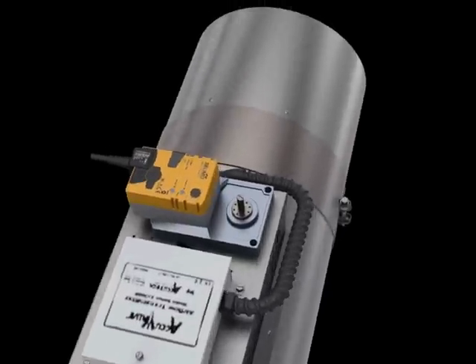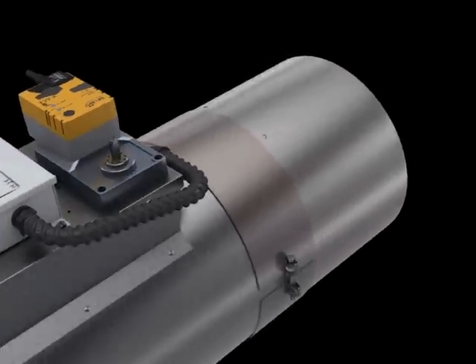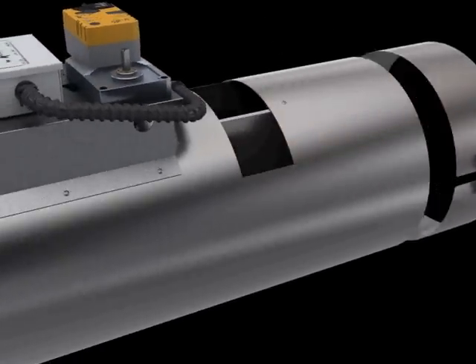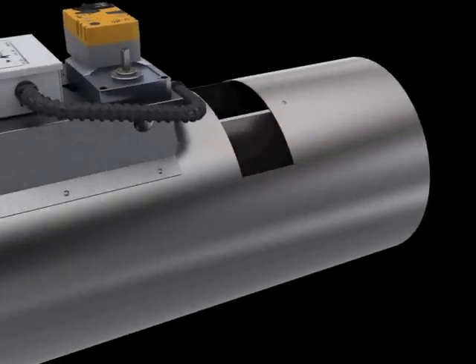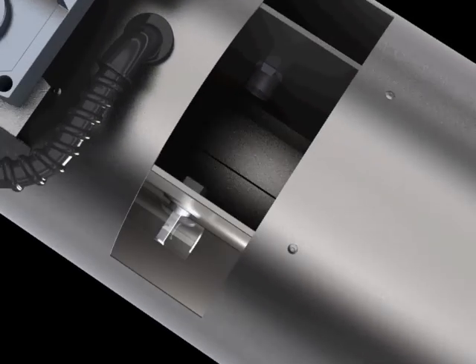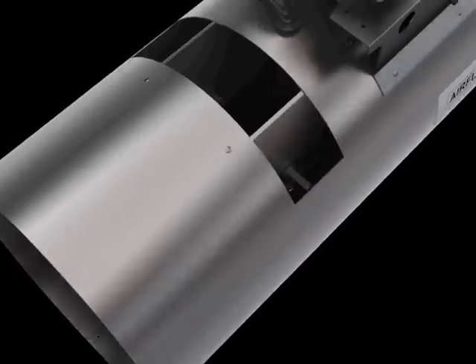AccuValve also comes standard with an integral removable access door for viewing airflow sensors, eliminating the need for duct access doors as would be required for competitive valves per ANSI Z 9.5.